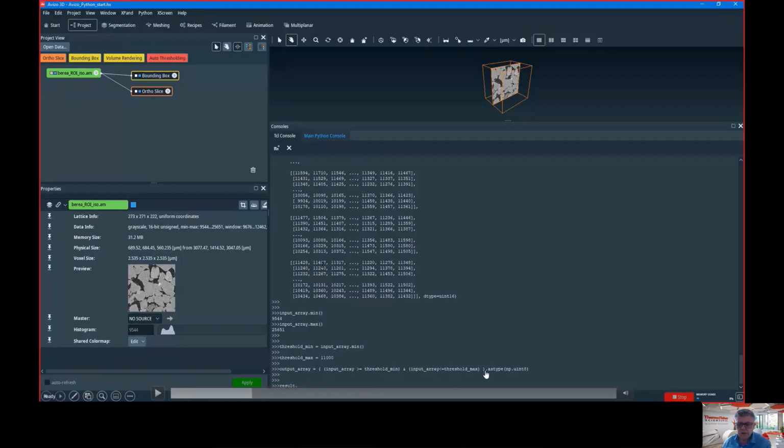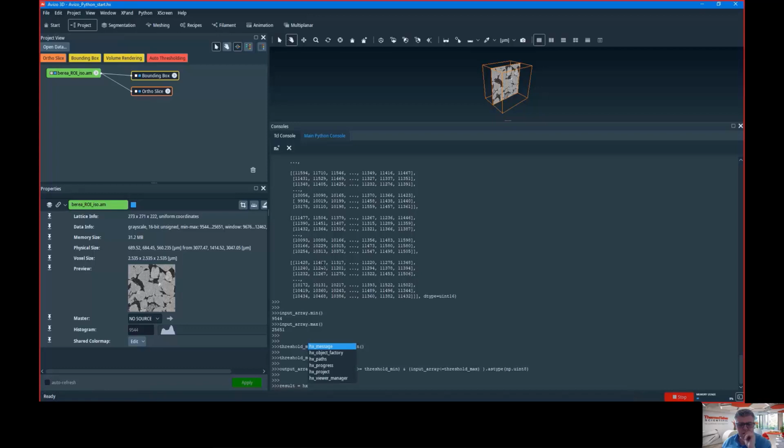This code could have been extremely complicated, with your own machine learning code to do segmentation. Anyway, now I have to create an object in the tree, in the project, of the right type to host this segmentation.